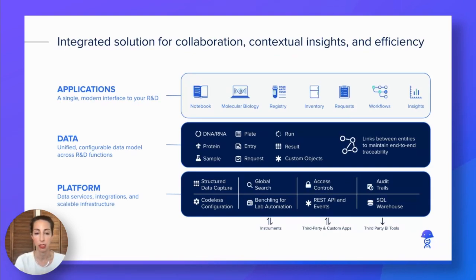By contrast, Benchling is built on a modern, unified cloud infrastructure that provides a configurable data model that maps to the team's unique scientific and operational requirements. Having a unified data model is critical to be able to ensure the full traceability of samples and experiments, as well as the ability to perform ad hoc and systematic queries of the data for analysis, samples, and process intelligence.